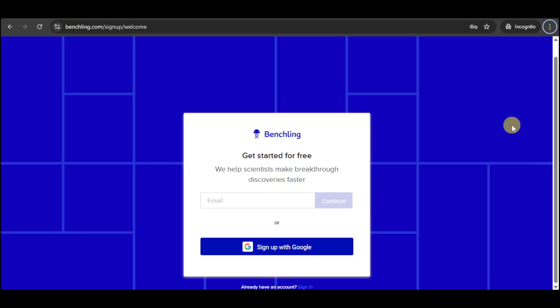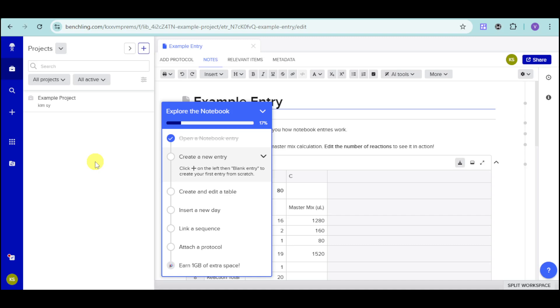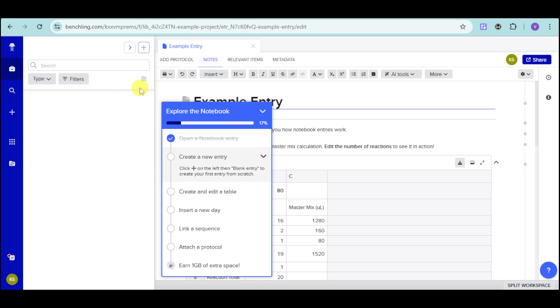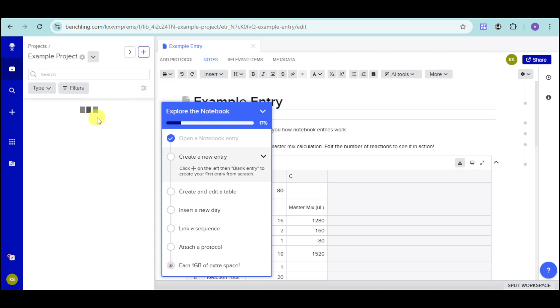I'll show you what this dashboard looks like. Here is the BenchLink dashboard. Here we have our projects, and onto this particular project, we have in here the notebook. You just click onto the project, and then from in there, you should be able to see in here the options. Like for example, we have in here this entry, and onto this entry, we can see in here the notes.